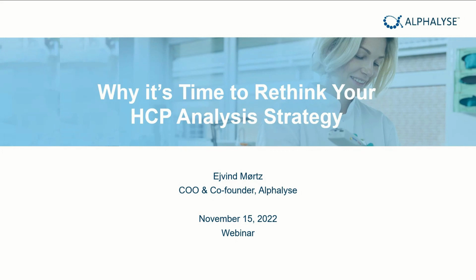So my talk is divided into three different parts. The first part is why we should do HCP analysis and the importance of using LCMS. The second part is about the LCMS analysis and assay performance. And the third part is several case examples from application in CMC development of new biologics.